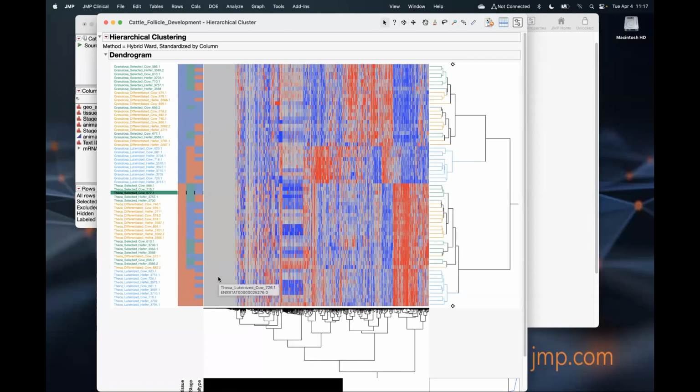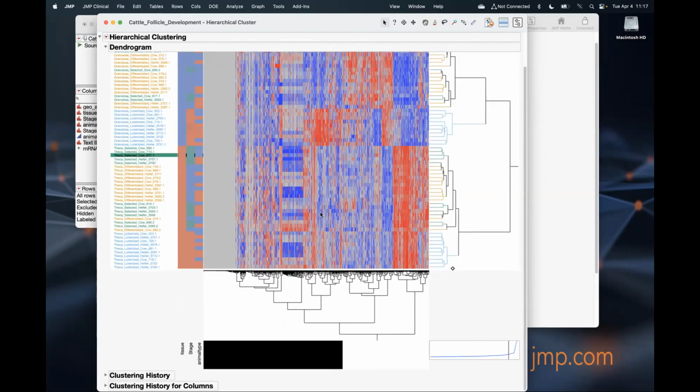Zero counts, in this case zero log values, and that's pretty much what we're going to do. There are other things too. It's the proportion of missing we want to get rid of. So that's my first obvious thing to do: things that have nothing but missing data, and things that have a certain proportion of missing data. That's what I can do.